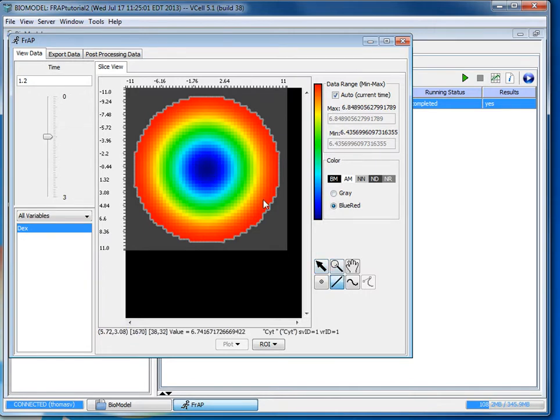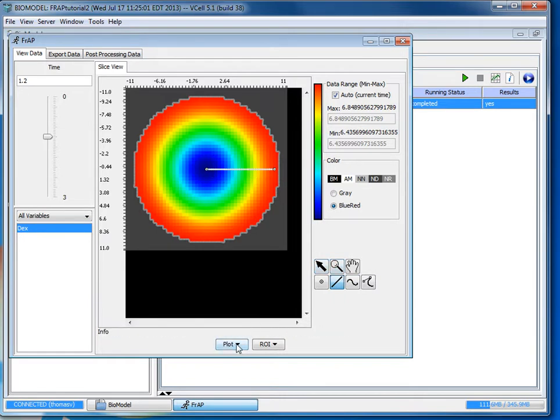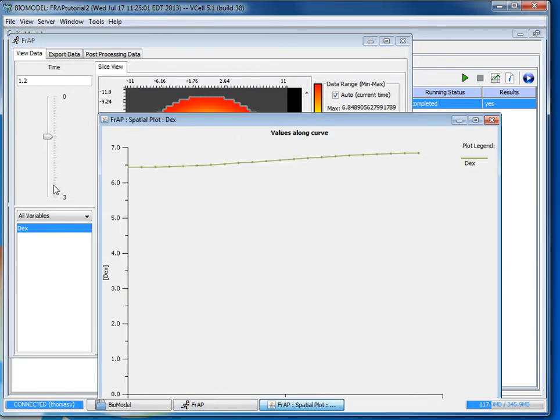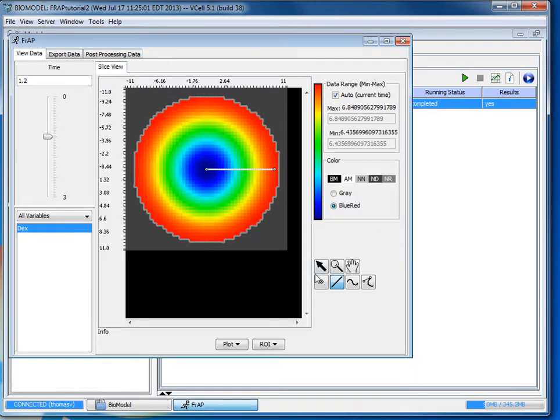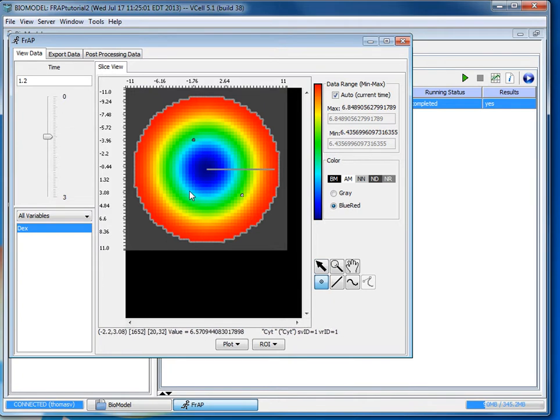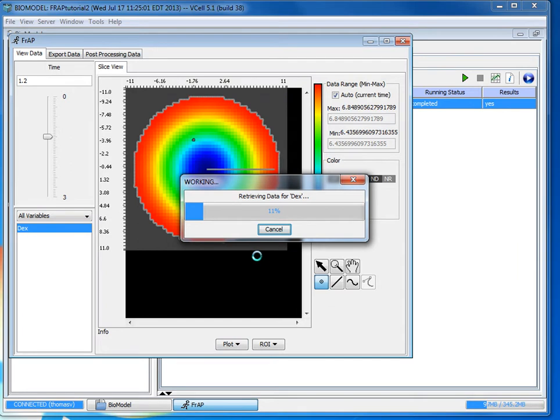You can use the line or the spline tool to select a region of interest and create a spatial plot. This is what the spatial plot would look like but for this model it's more interesting to use the point tool and you select one or more points within the cell and create a time plot.